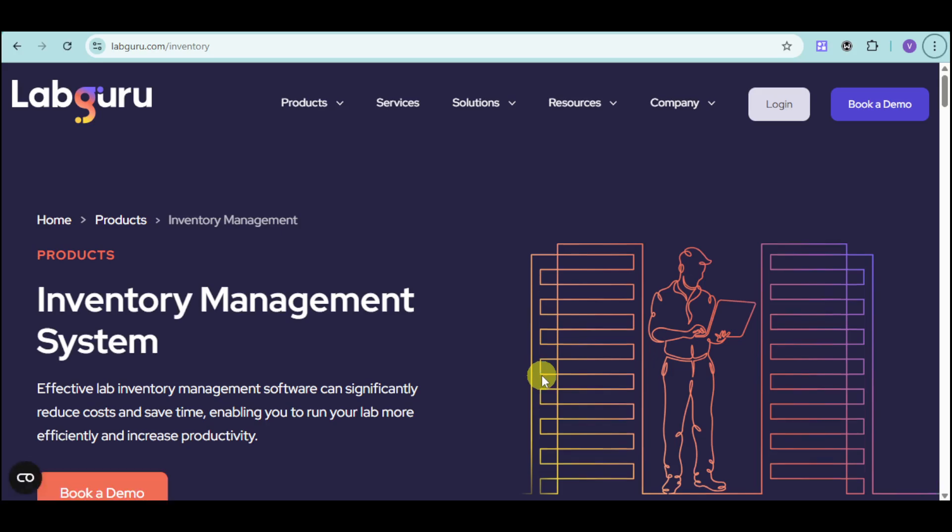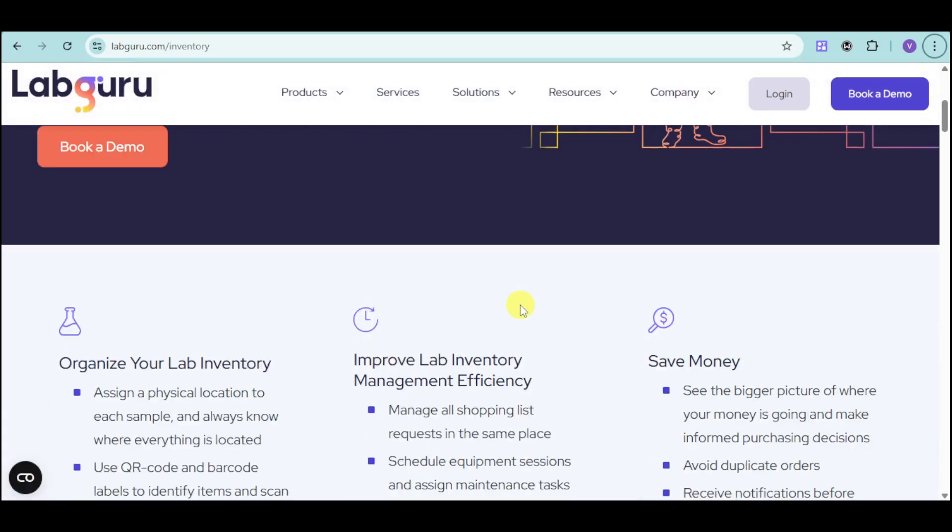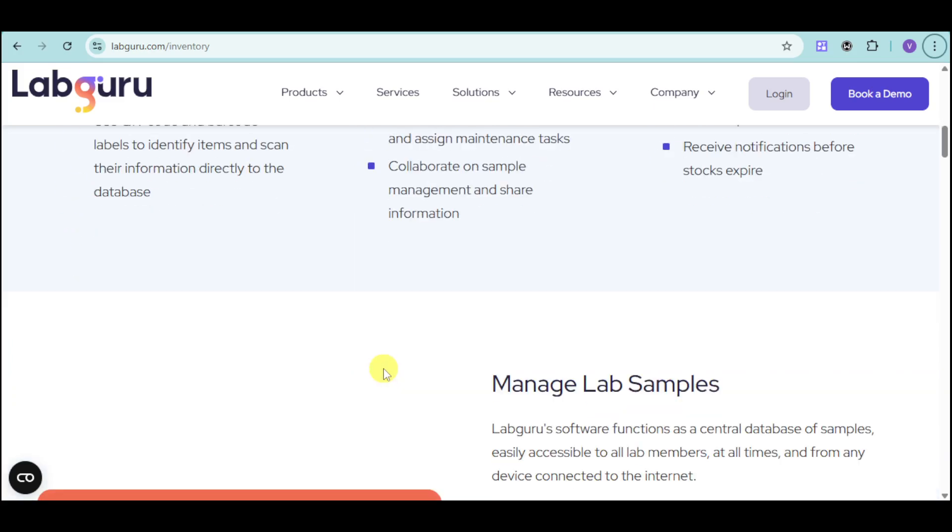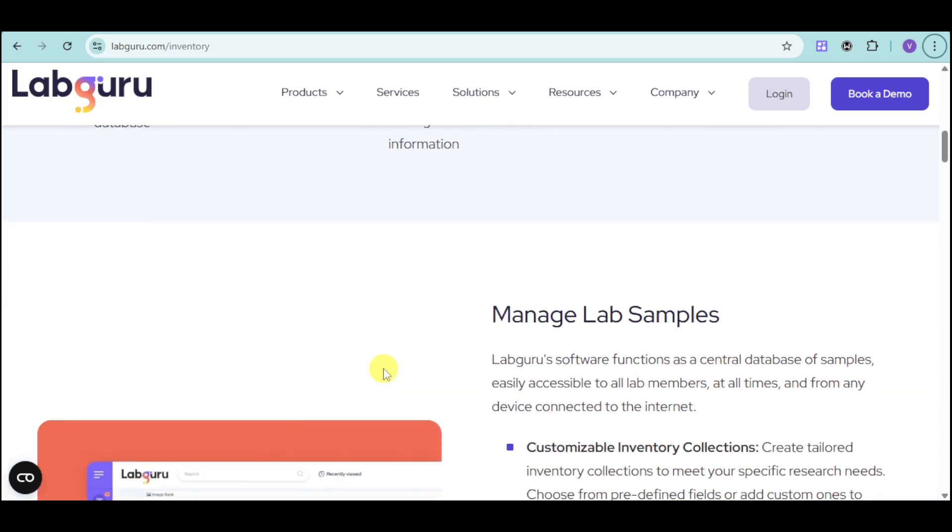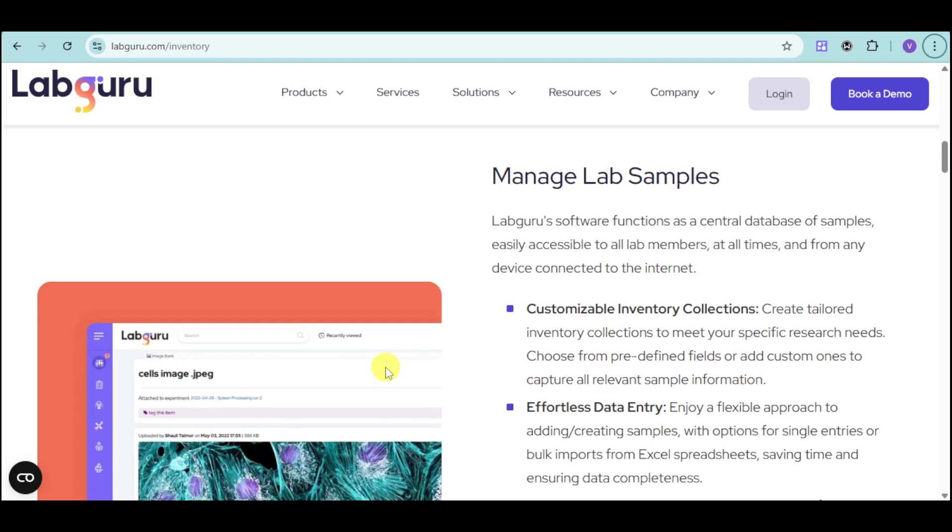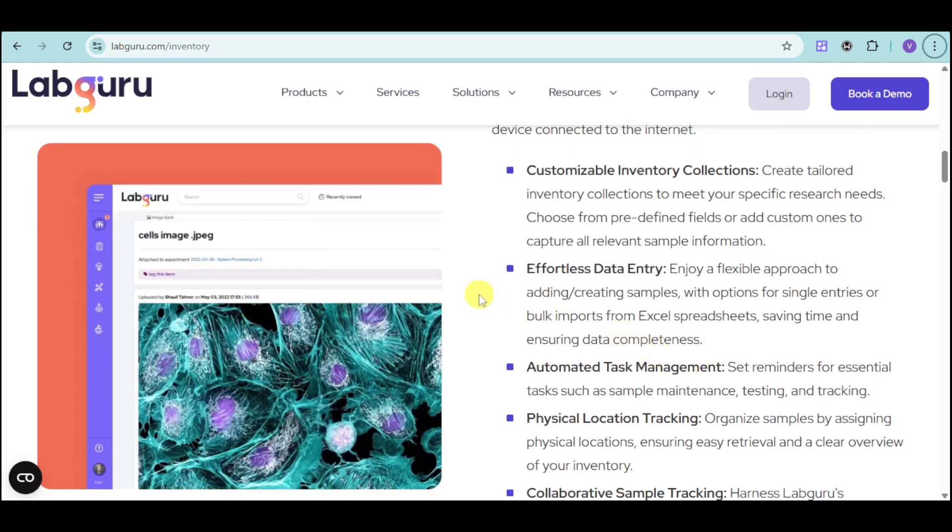LabGuru also has an inventory management system wherein you can keep track and organize your lab inventory, improve lab inventory management efficiency, and save money to avoid duplicate orders and receive notifications before stocks expire. You can manage your lab more easily and manage your lab samples.